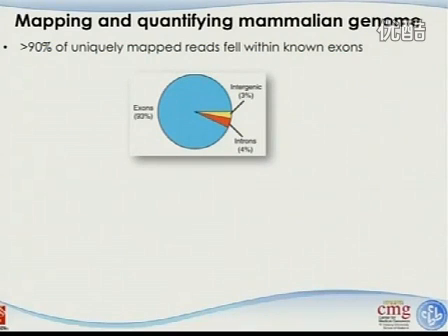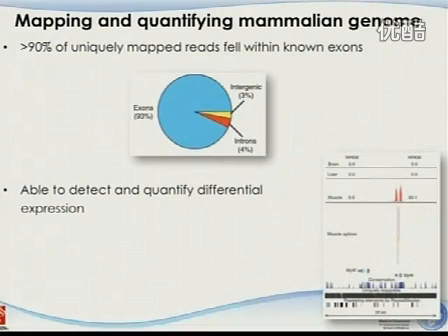One of the reasons that they can achieve this high percentage, I think, is they did poly A selection. So they focus the most on the mature messenger RNAs. But if you do another type of assay, if you use random primer and ribosome depletion, there's no way you can get such a high percentage. But this is what they get.